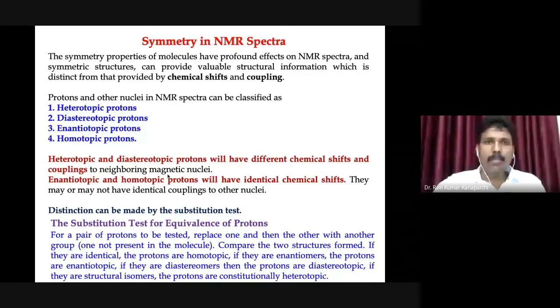But the question is how one will find out whether a set of protons are homotopic, heterotopic, diastereotopic, or enantiotopic. Well, we can follow the substitution test.